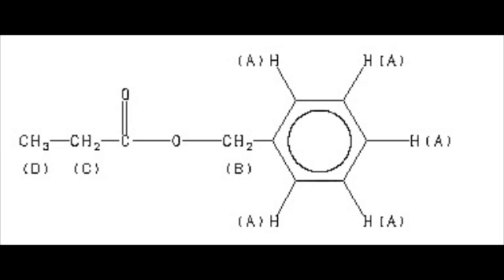And looking at D and C, those correspond to the triplet and quartet respectively, D being the triplet and C being the quartet. And of course that quartet is a little bit more downfield than the triplet because carbon C is next to a carbonyl group, which will deshield it because that C in the carbonyl group is very deshielded due to the very electronegative O's there.